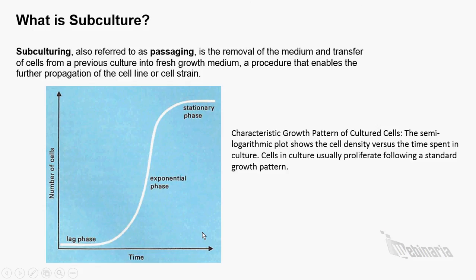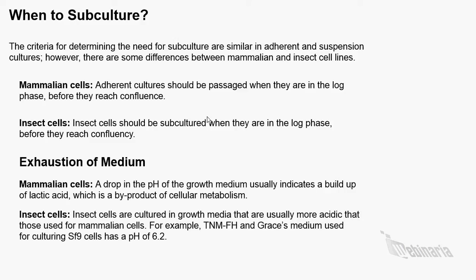Basically, the log phase is from when the cells start growing fast until the start of the stationary phase. In log phase, cells proliferate exponentially and consume the nutrients of the growth media. When all the growth media is spent, or one or more nutrients is depleted, or when the cells occupy all the available substrate, the culture enters the stationary phase, which is also called the plateau phase, where proliferation is greatly reduced or ceases entirely. Okay, so lag phase, log phase, exponential phase, and stationary phase.